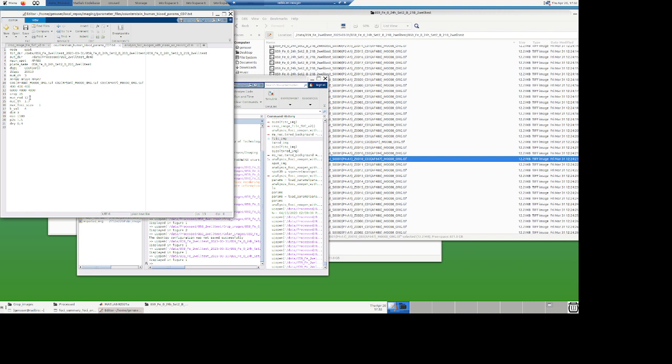Nucrad is the radius of the nucleus in pixels. That's for these images that you have to play with, otherwise segmentation is going to completely crap out. So 12 is a good number. We play with that for this data set. Same thing, this is trial and error. Run the script, see how it looks.